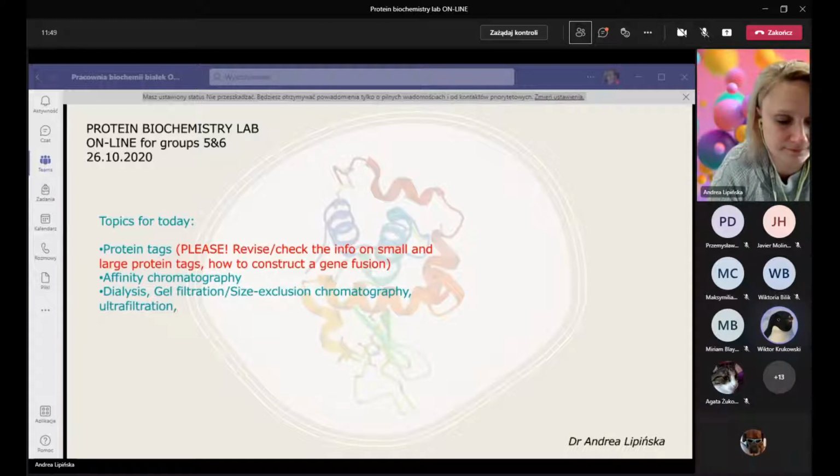Maybe in some studies like the two-hybrid system in yeast? Okay, but this is a very specific situation. So again, interactions. It's quite true for GST usually. Well, we don't see it too much, maybe. To increase the solubility? Yes, to increase the solubility of a protein, especially bigger tags are used like that. So we choose proteins which usually fold quite well by themselves, or they don't need too much help from the chaperone system. So then they are used as tags.